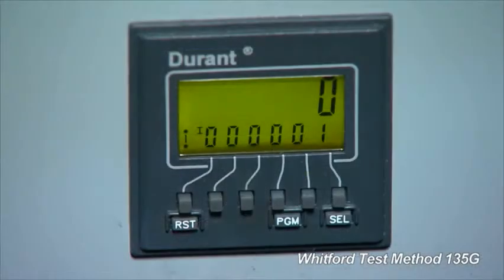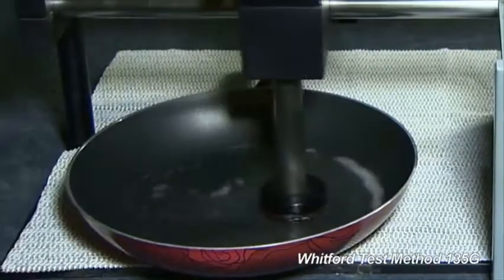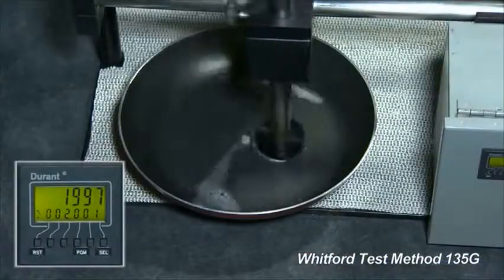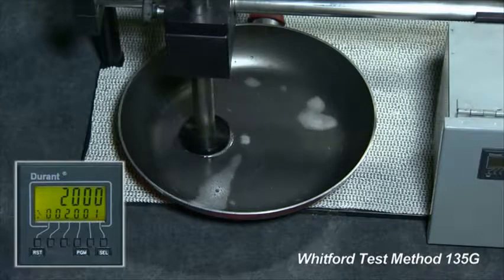Set the counter to 0 and start the test. Run the test for a specific number of strokes. Whitford stops it at every 2,000 strokes to change the Scotch-Brite pad.